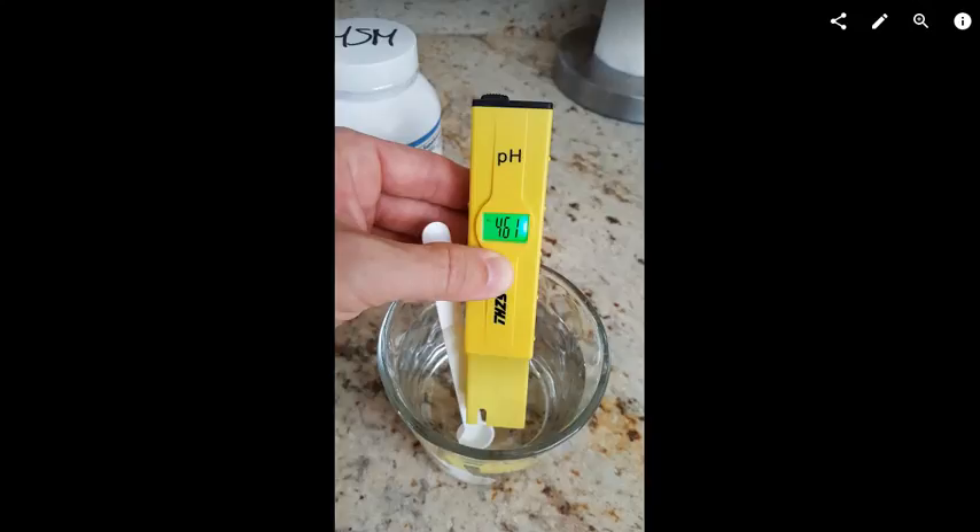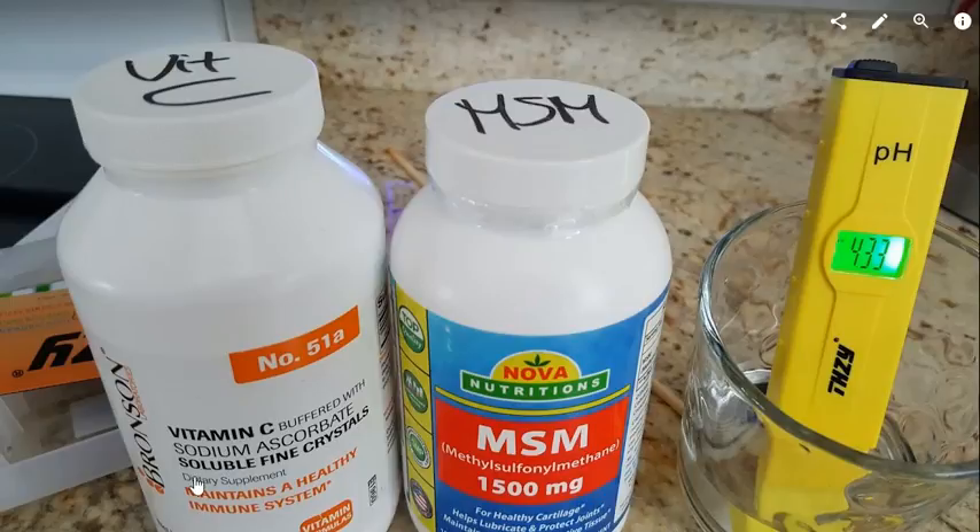Hi guys, this is a quick video about the pH value of some buffered vitamin C. I bought the Bronson number 51a, which is quite common and has a good reputation on Amazon.